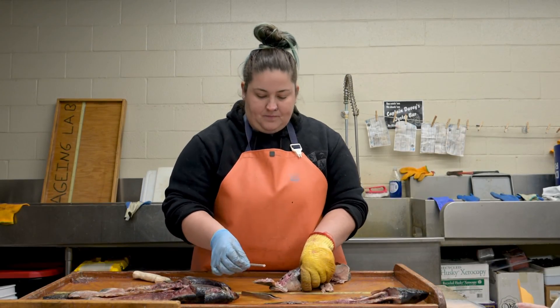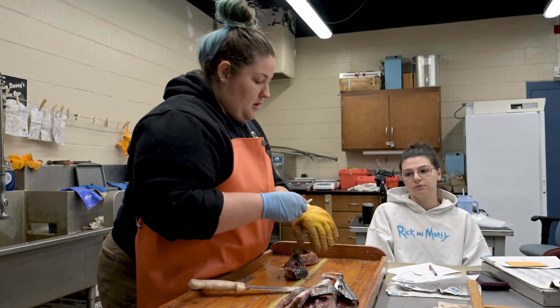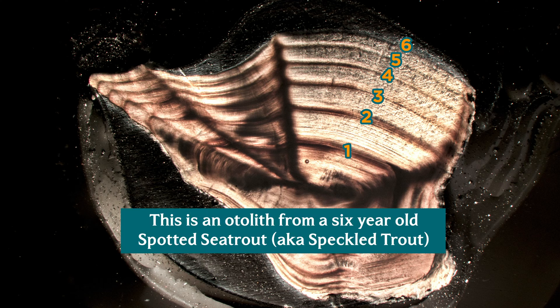And one on the other side. I'm going to go ahead and clean these up with a little bit of water. When we look at these underneath the microscope, we will be able to see the growth rings — the annual growth rings. Each of those represents a year of growth for this fish, so we'll be able to tell how old this male fish is, and that is going to go into our stock assessments.